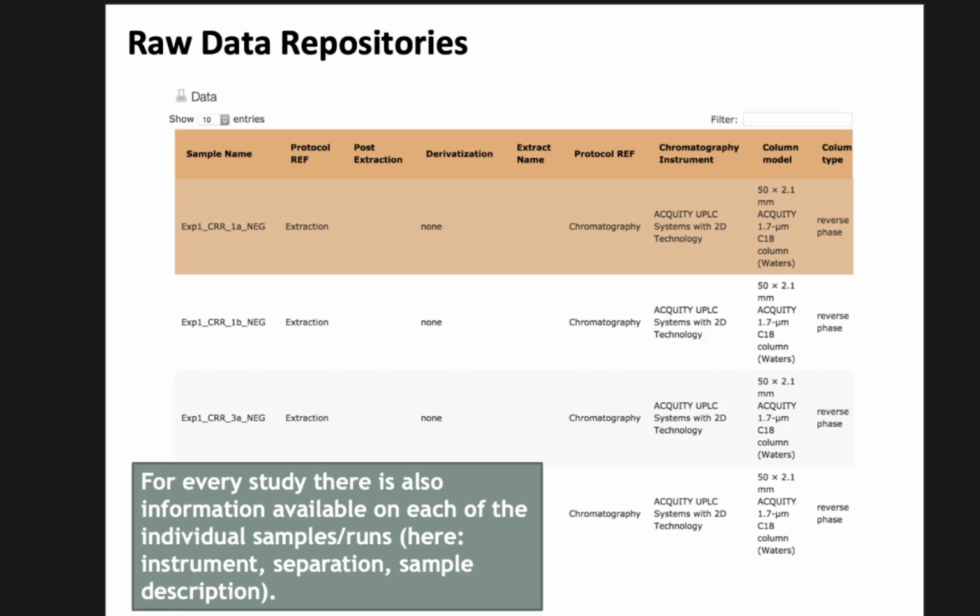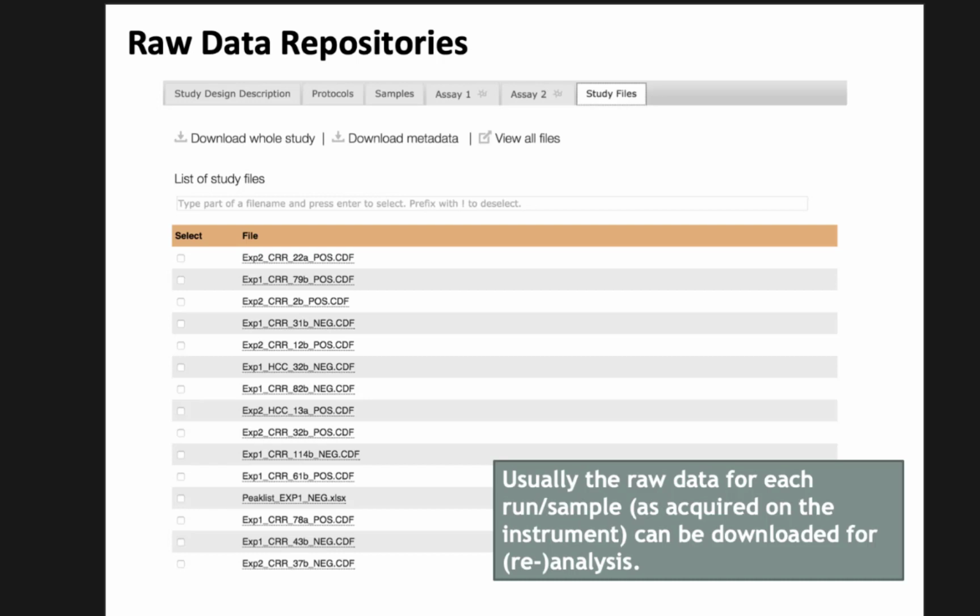You have some data on the runs, which file is actually what, which are the diseased, which are the control patients. That is also essential in many cases. And it just makes it much simpler to then download all the data and reprocess it. And if you have a workflow, you can reanalyze other people's data within a couple of minutes. And that makes it very convenient to also ensure that you are on par with what other people are doing and makes it easier to publish things.